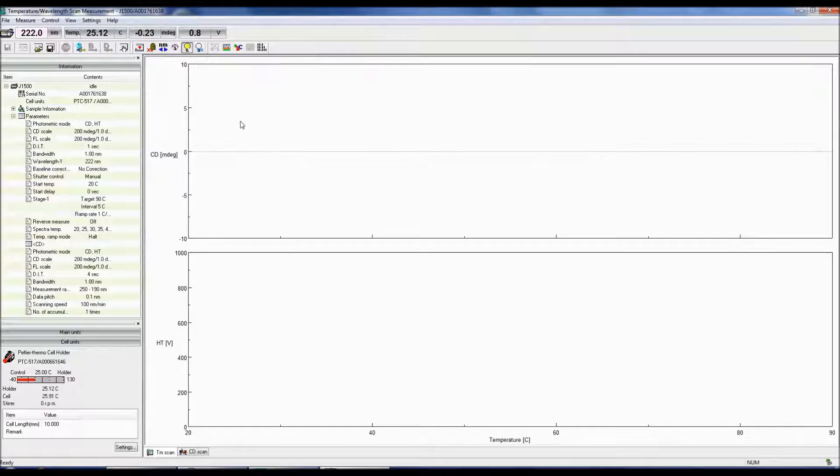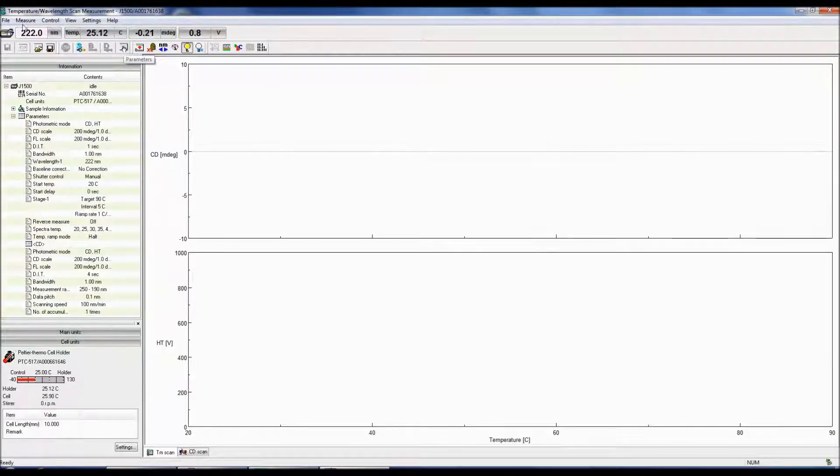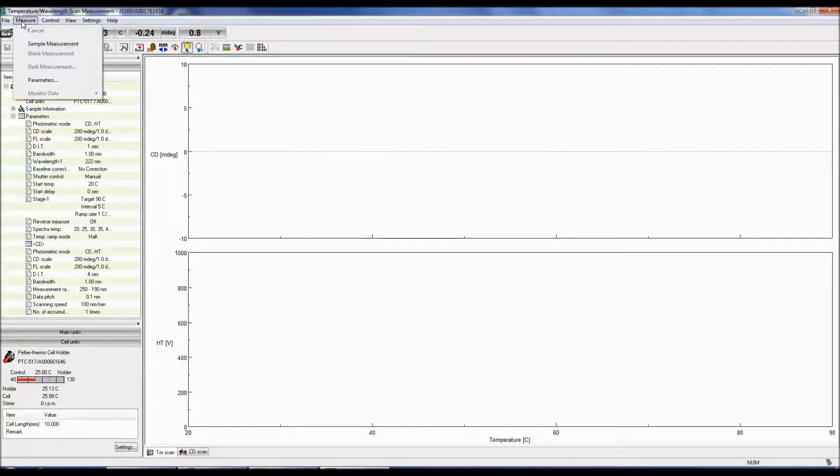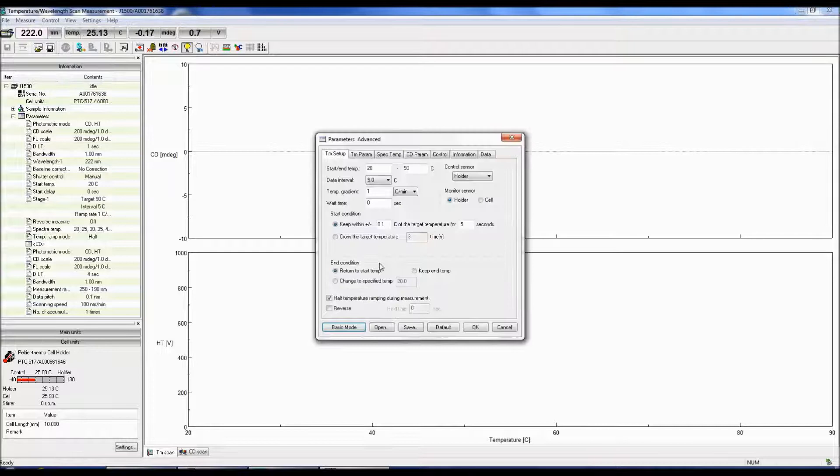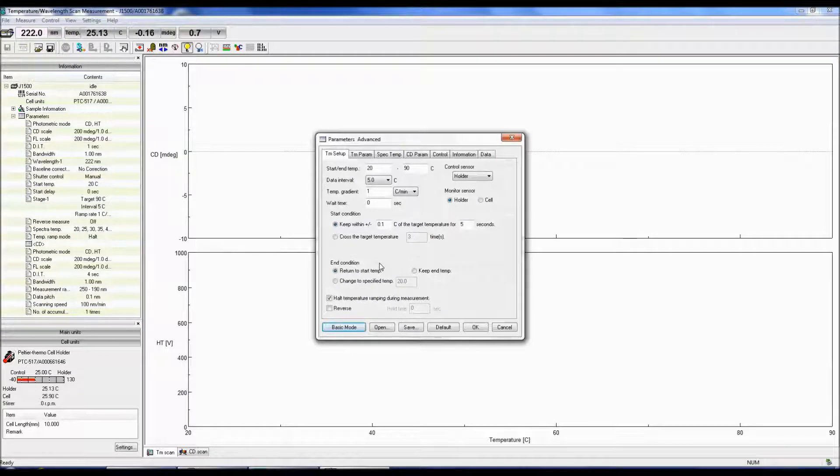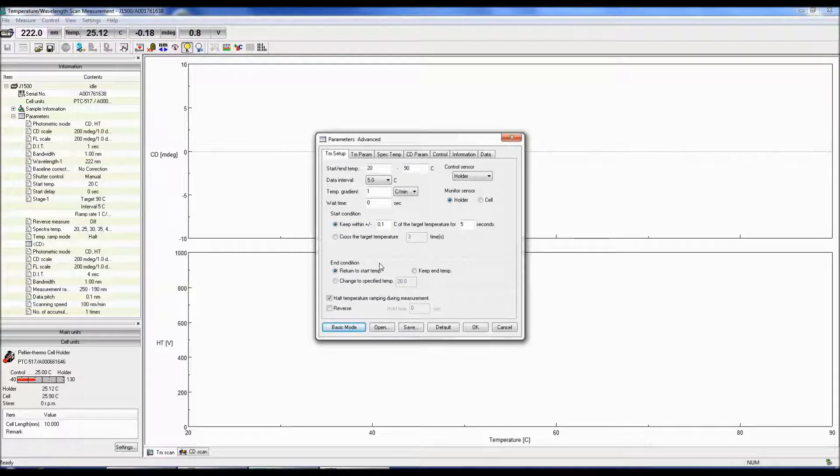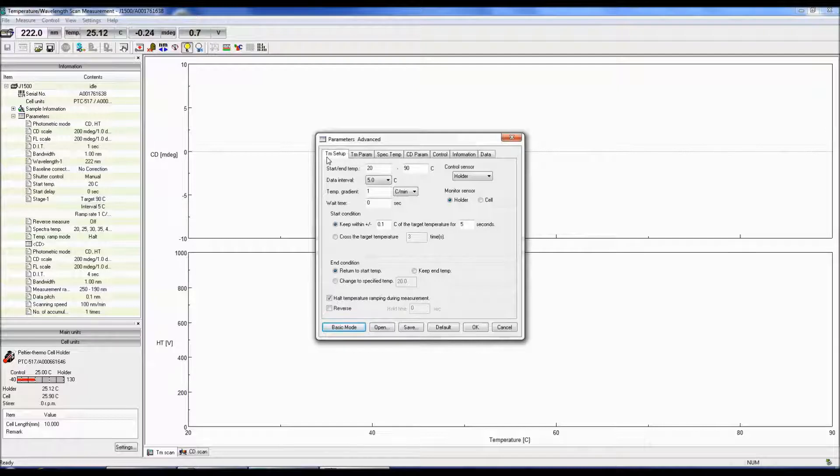To set up your parameters, either click the Parameters icon or go to Measure Parameters. The Parameters menu box will now pop up and the first tab selected will be the TM Setup.